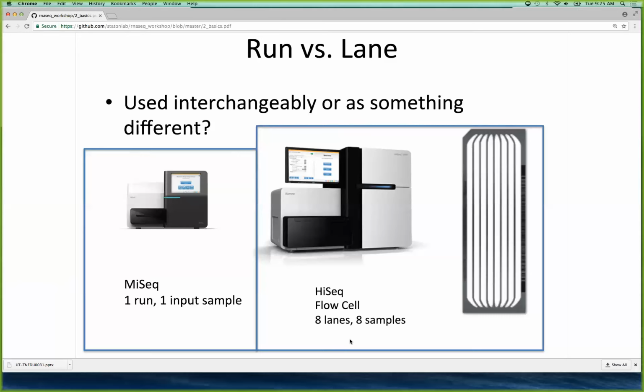So this is one of those things where you want to work with a really high quality sequencing facility, because I got some data back from, maybe I shouldn't say names, I shouldn't be throwing other universities under the bus, but I've gotten data back where they mixed my 20 samples, and some samples had almost no coverage, and 2 or 3 samples ate up the whole lane.